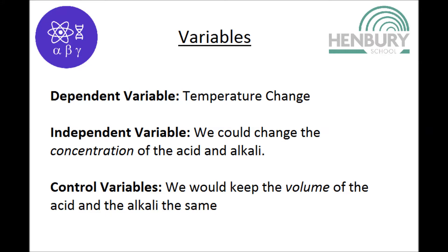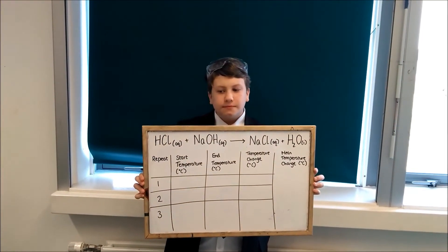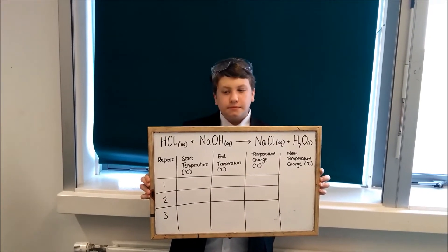This video will take you through required practical 10. We are investigating the change in temperature of different reactions like neutralisation. We will mix hydrochloric acid with sodium hydroxide, which is an alkali.